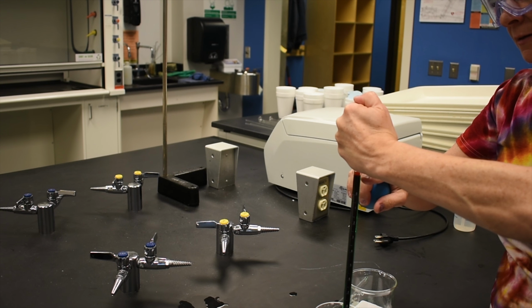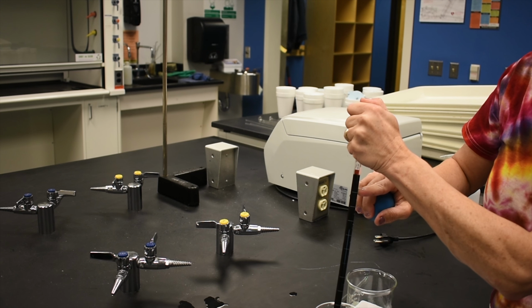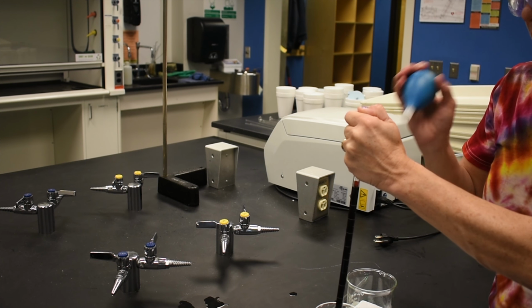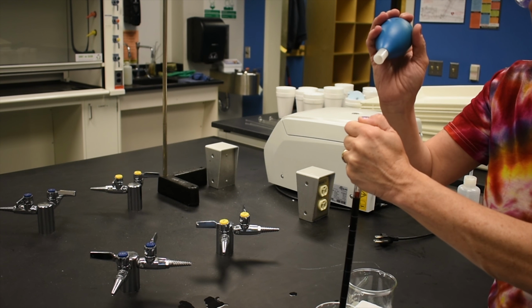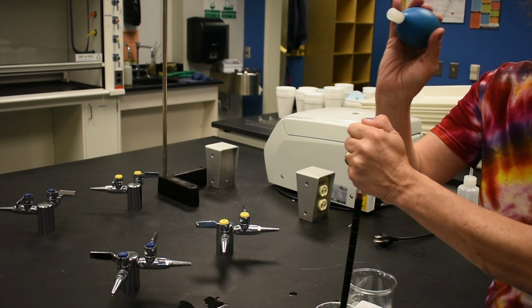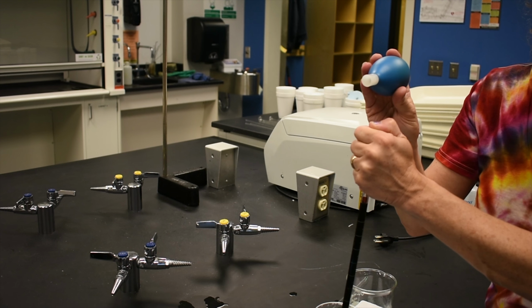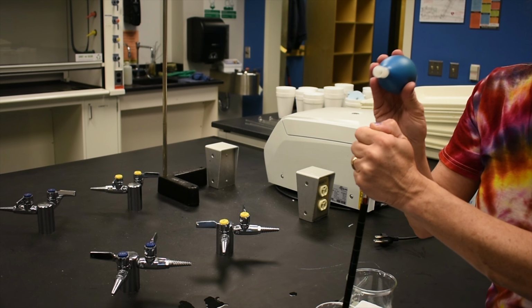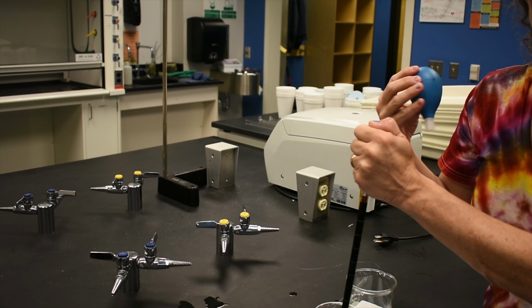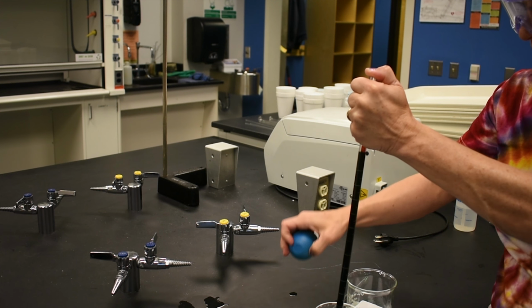All right, so a couple things to notice here. You'll notice that the solution is above the 0 line, which means I have more than 10 milliliters in the pipette right now. The second thing you'll notice is that I did not pull solution all the way up to the very top of the pipette, and I managed to keep the pipette bulb dry. It's very important not to pull solution into your pipette bulb. If you do that, you need to get a new bulb, let your TA know, and make sure the bulb gets dried out.